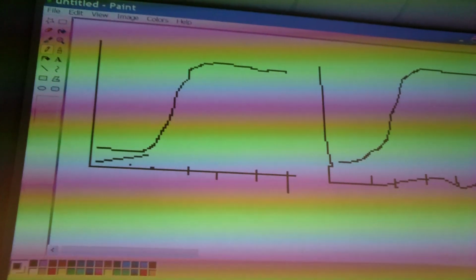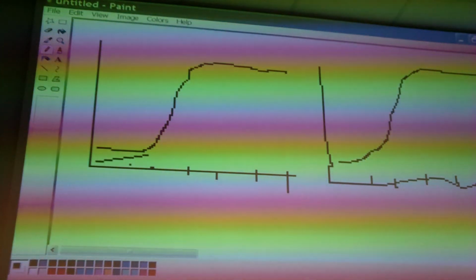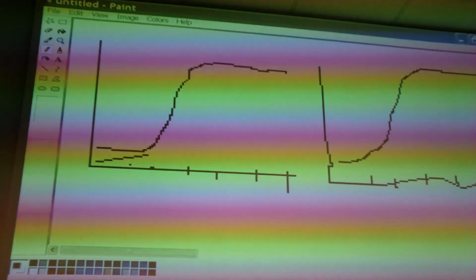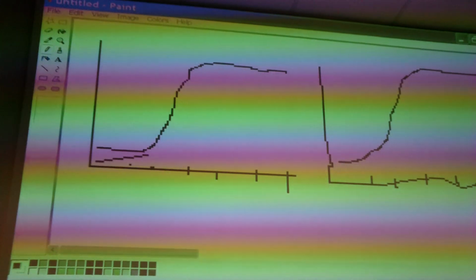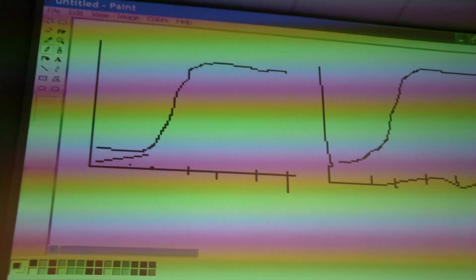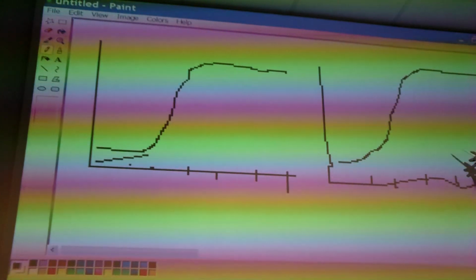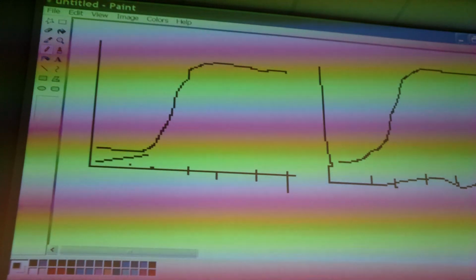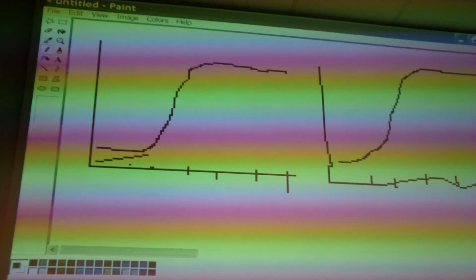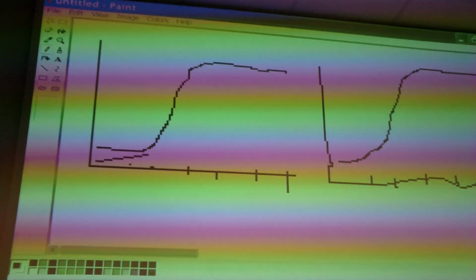You start with the standard sample, you know, 1 gram per liter, you make a dilution curve. That gives you that signal. Your sample you don't know, but if it gives you the same dilutions, exactly the same values, it should give you exactly the same curve. If it's a factor 10 diluted, the curve will drop down much faster. And you can use those values in Excel, I'll put it on a link, to calculate the difference in concentration between your standard and your sample.